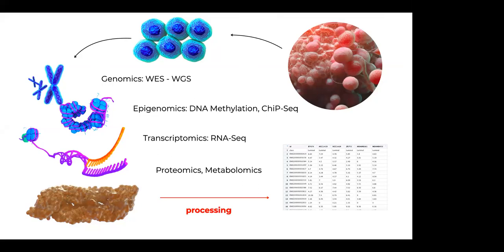So you see here in this image, there's a table, right? And that table is showing the data that has been obtained from one of these experiments. So in the end, it's a table, or it's data that is not structured, but we want to make it structured like this table so that we can do the analysis.